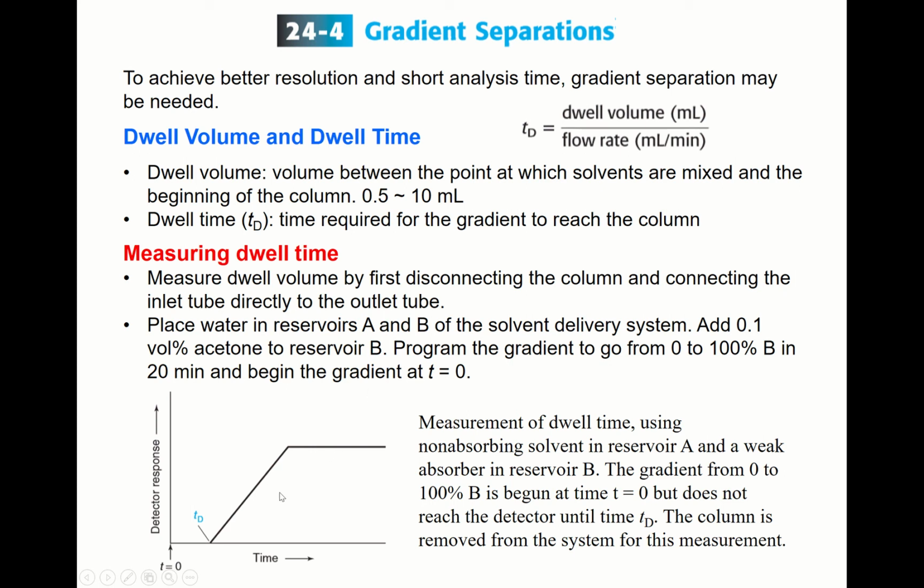It will look like this. Look at that. Now you injected at this point, time 0. During this time, until the dwell time, the detector response is 0 because there is no acetone. Acetone needs time to pass through this part, and then finally the acetone begins to be detected.